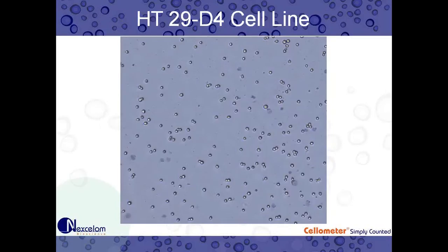Here's our HT29D4, a human clonal cell line derived from colon adenocarcinoma cells, on our Auto1000 software. Again, you can see the similar morphology — a nice round outline on the live cells with a bright center, and then some weaker and darker stained Trypan Blue dead cells.